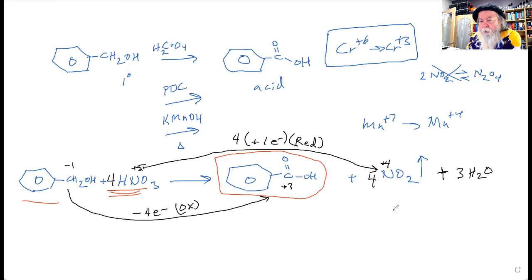Again, I want to caution you, the faculty and the TAs will be walking around making sure that you're extremely careful handling nitric acid via syringe. We don't want any accidents in lab today or this week. So that should take care of what you need to know as far as the lab experiment goes. It should be very straightforward. Again, don't add the nitric acid too fast. That's the one thing that could cause a lot of problems. It can run away from you. So make sure you don't add too fast.